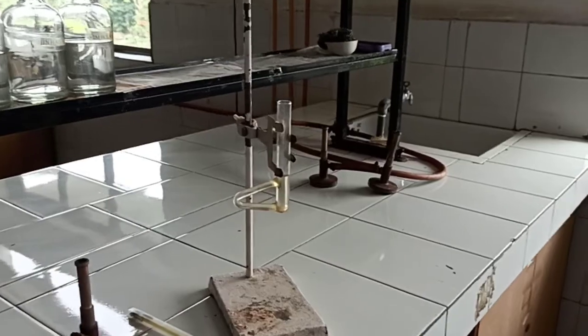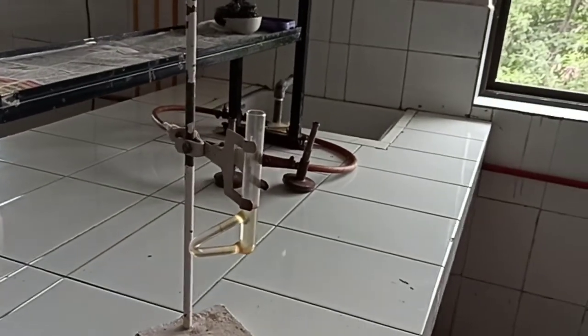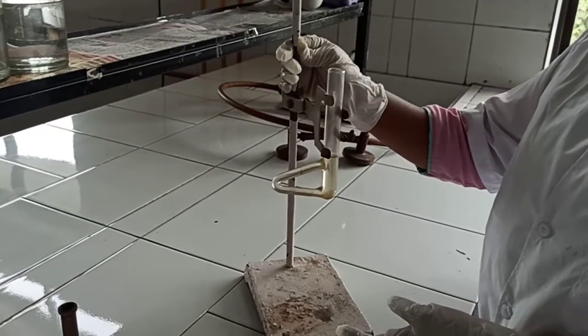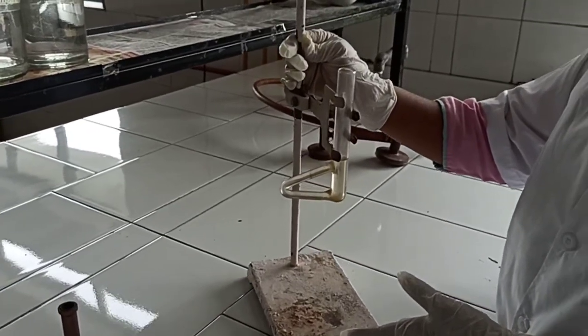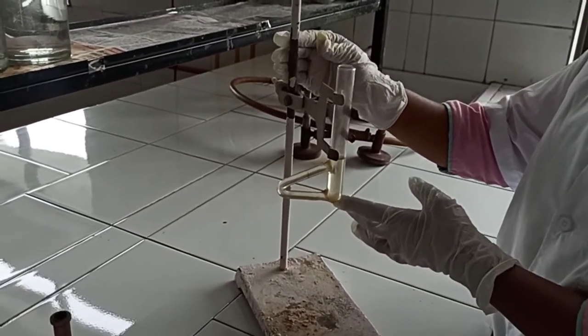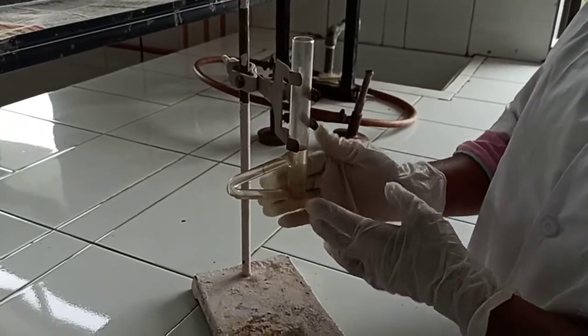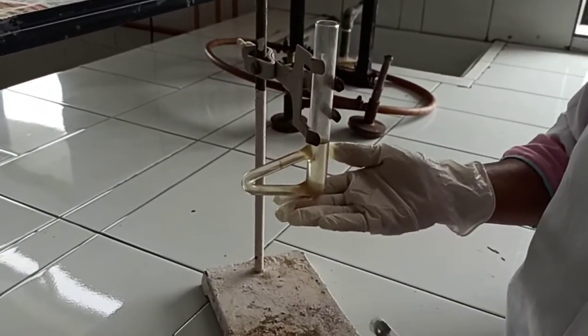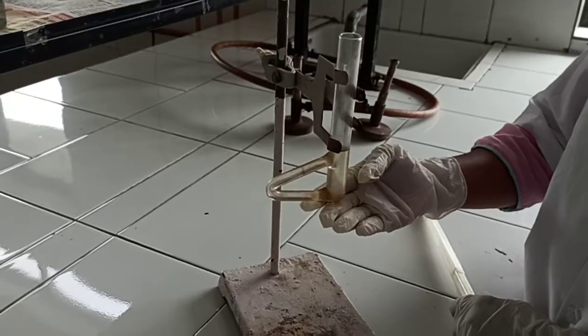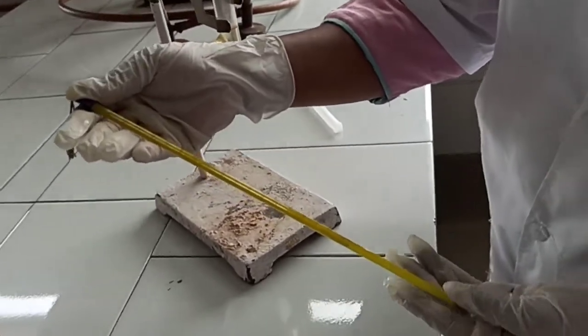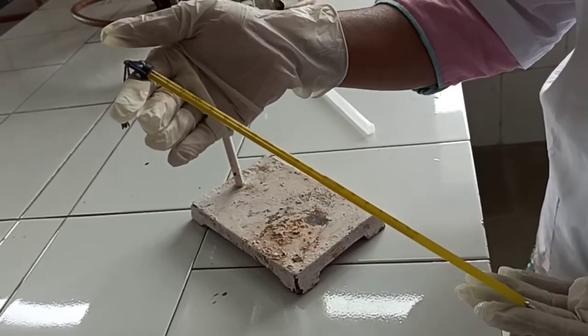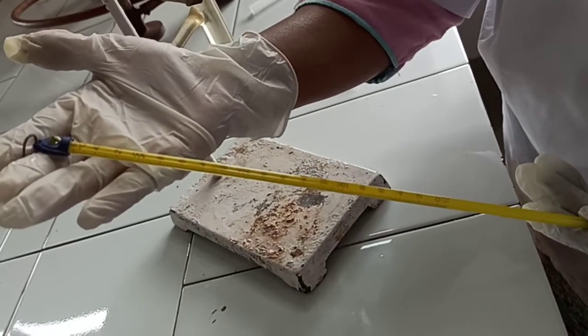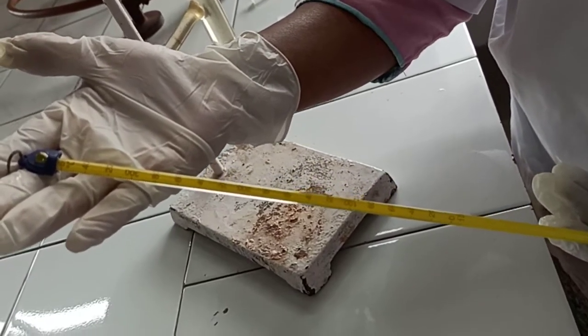See the different apparatus. This is stand that we require for holding Thiele's tube and ring. Then this is a Thiele's tube which consists of liquid paraffin. Here, the chemical thermometer is there. We can measure the temperature from 10 to 360 degrees Celsius.